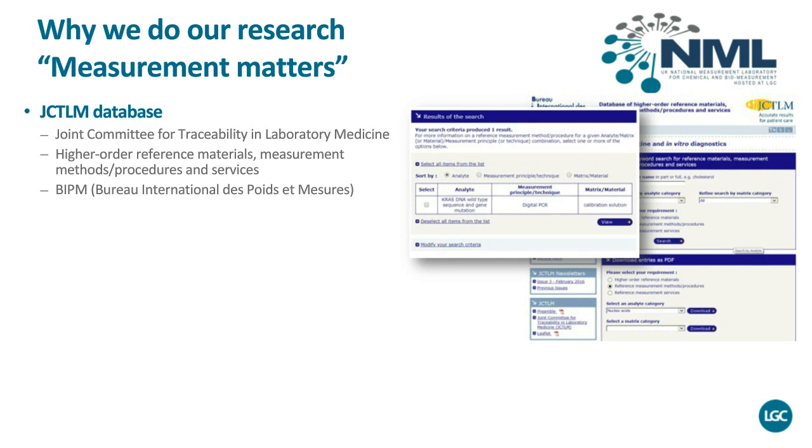So the reason this is important is last year we were successful in submitting the first PCR-based method to measure nucleic acids. And we used the KRAS G12D mutation in this context because validating whether a tumor is KRAS wild type or with a mutation stratifies that patient into what medicine they would receive as part of their treatment.